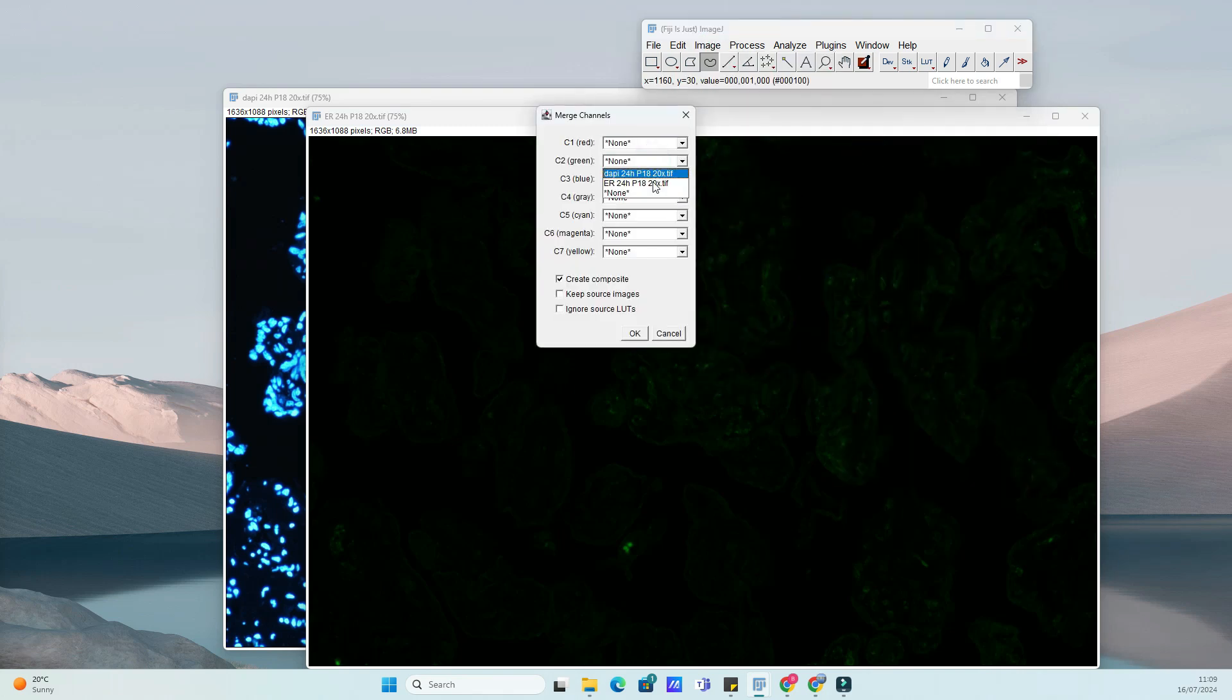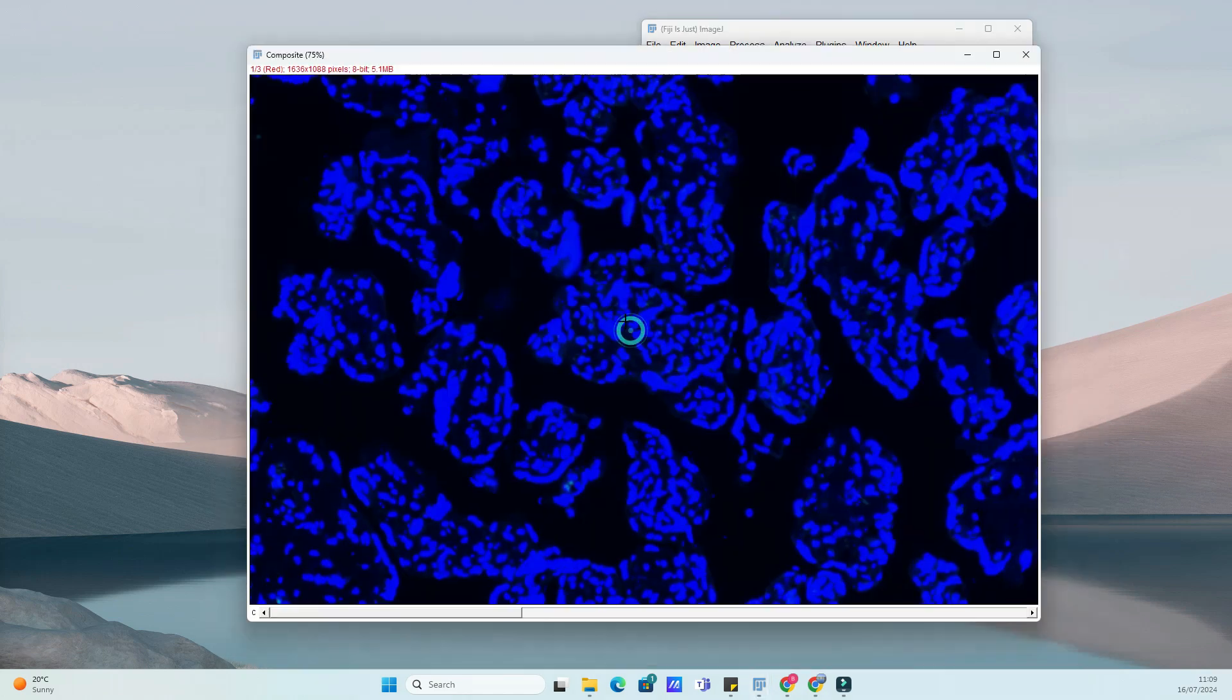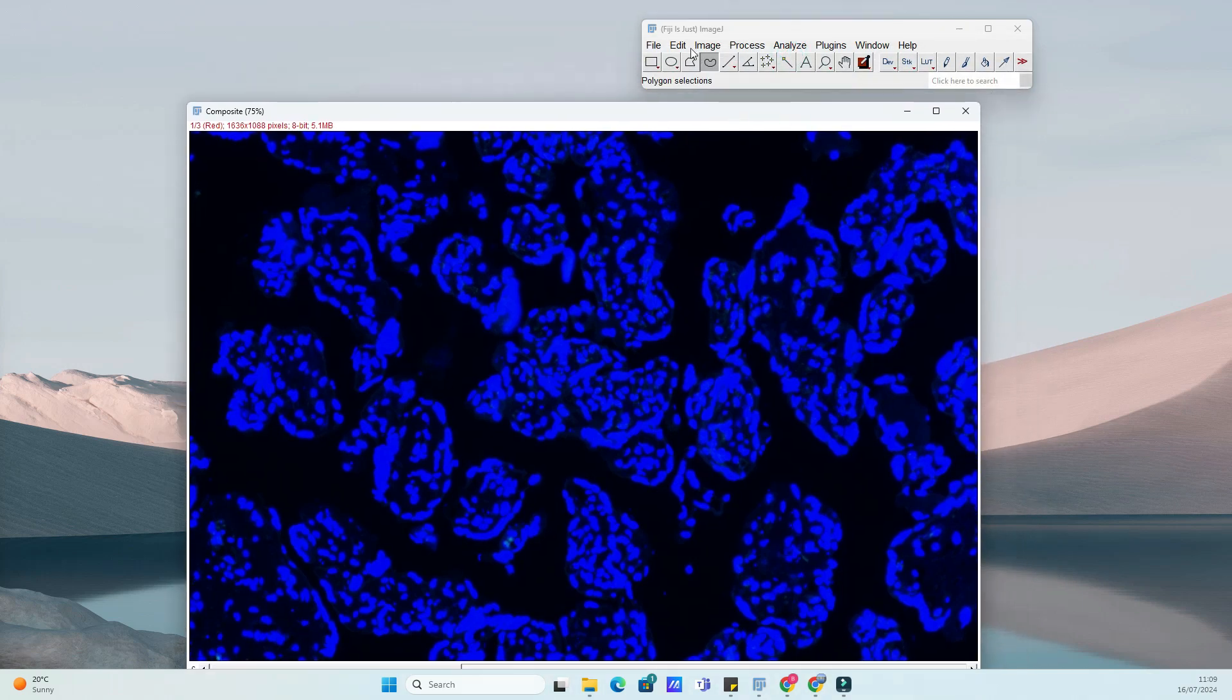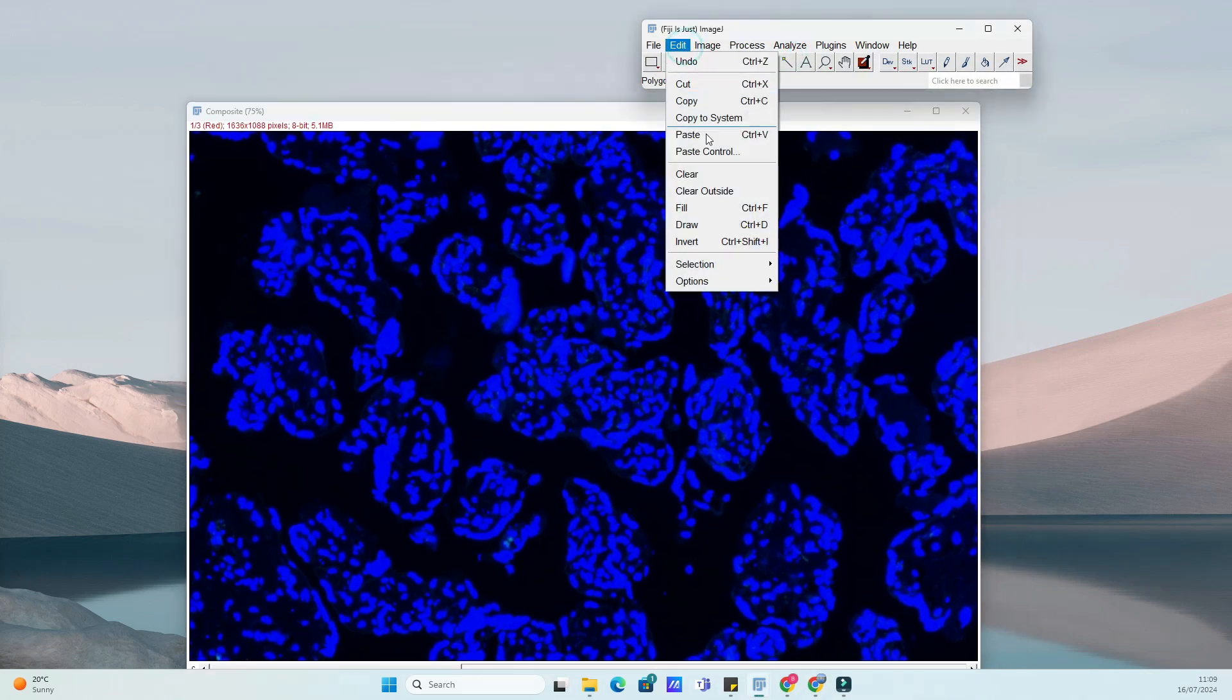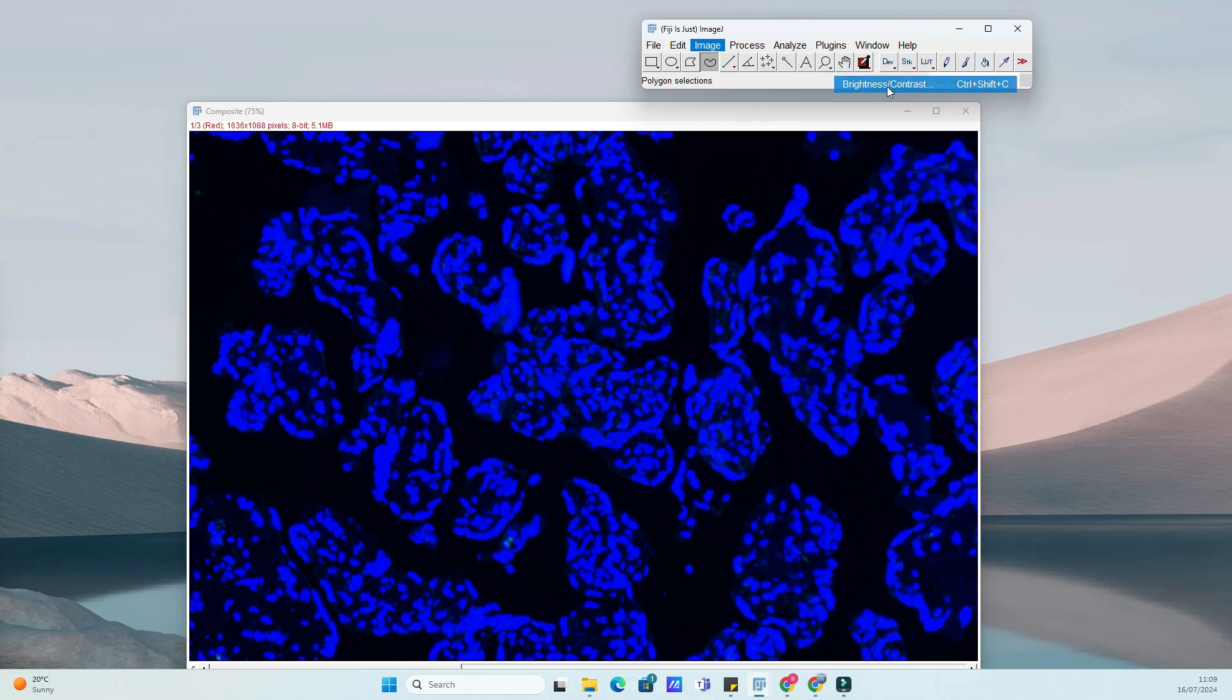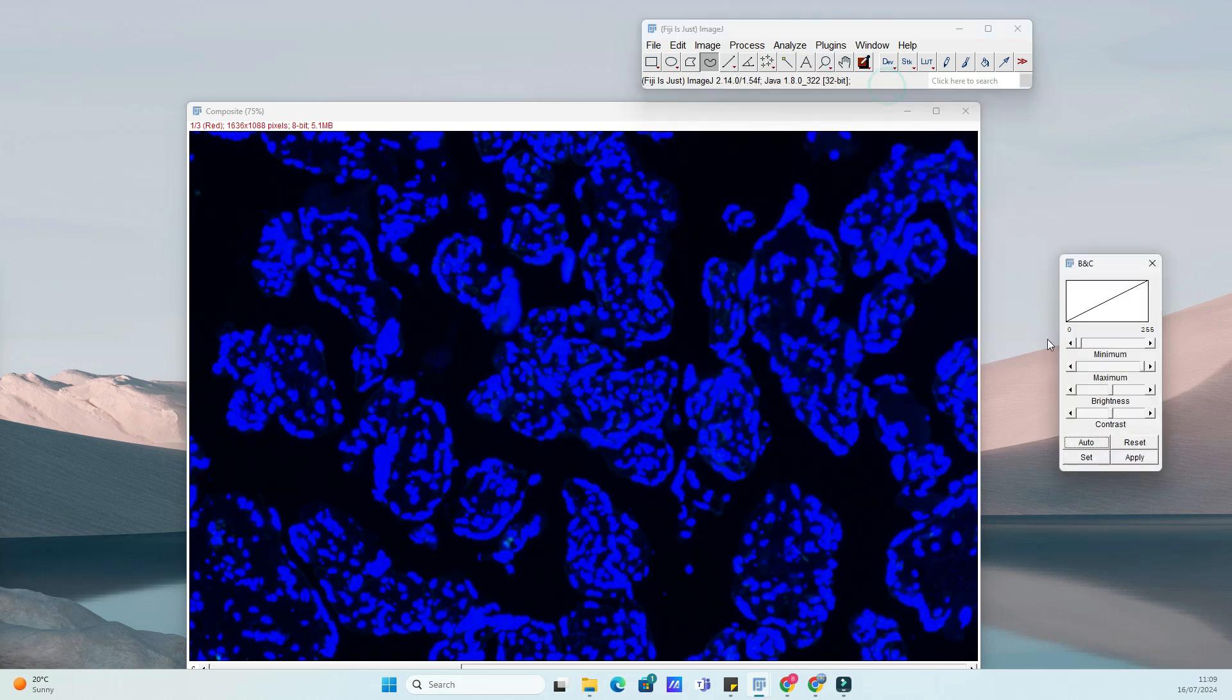Whether you're studying cell cultures, tissue sections, or microscopy images, this plugin is indispensable for accurate and efficient cell counting and analysis. The Cell Counter Plugin in ImageJ is designed to streamline the process of manually counting cells in digital images.